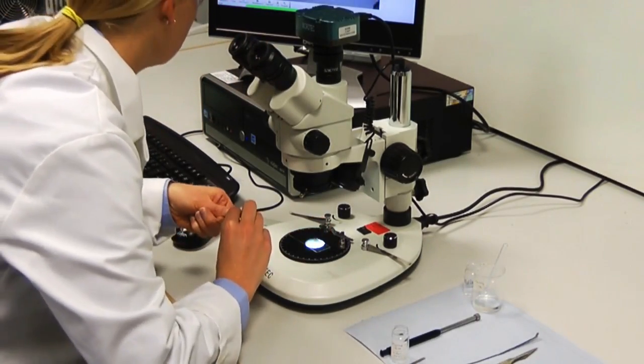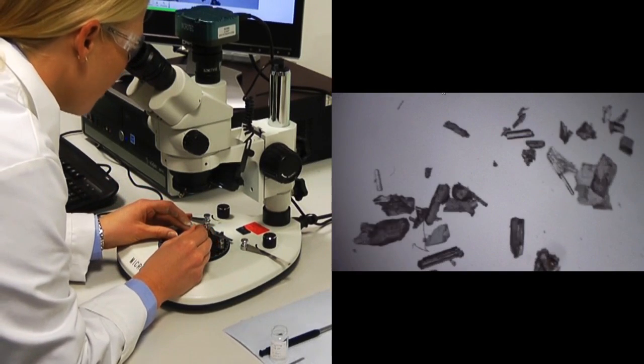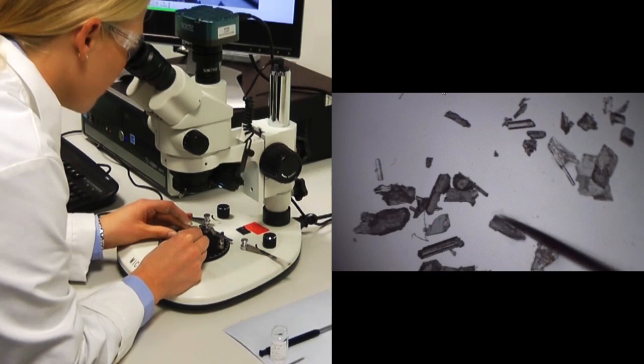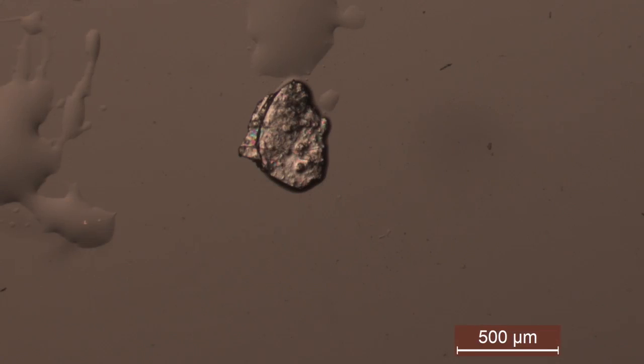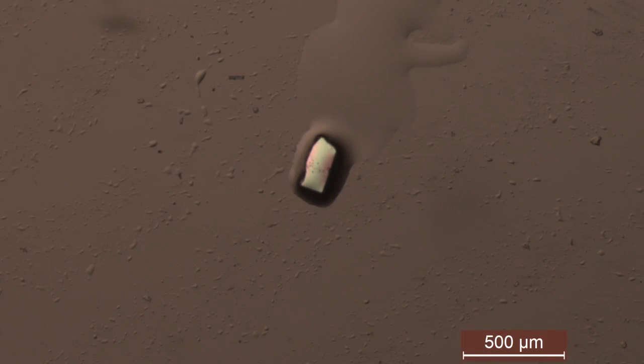Selecting a crystal can take some time, as not all crystals diffract as well as others. The best crystals are around 0.4 mm in diameter, with regular faces. The first crystal is exceptionally small, and this will be weakly diffracting and not a good choice. The second crystal is definitely not single, and is made up of more than one crystal. The third crystal is cracked and unsuitable. The final crystal would be the favourable one to use.